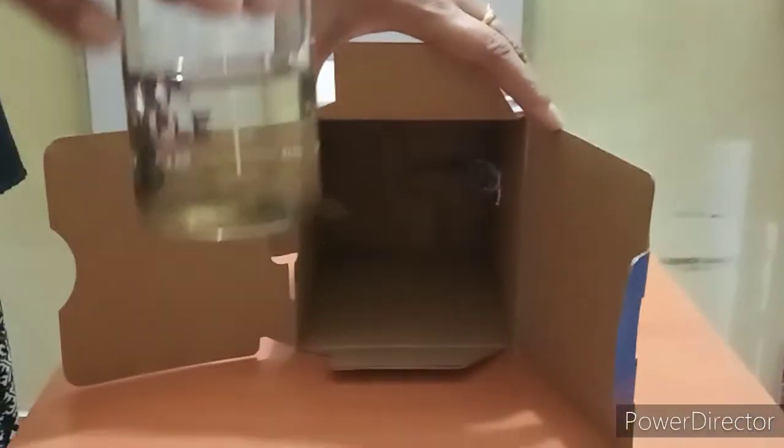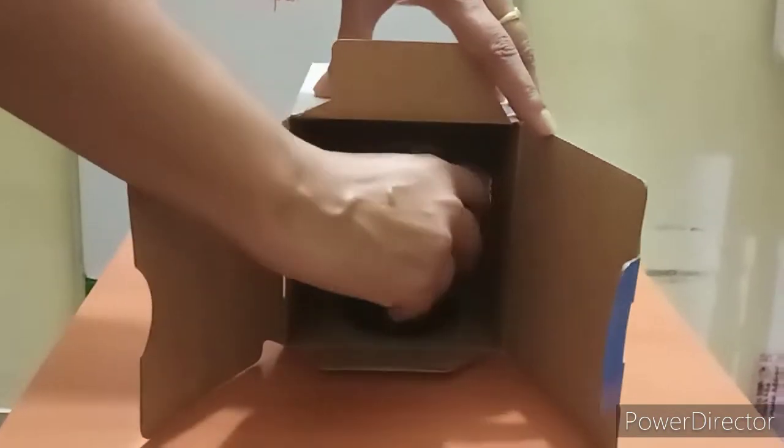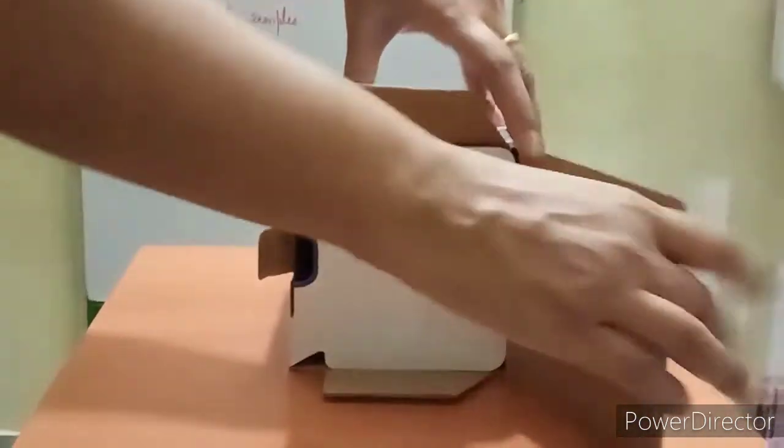Similarly, we are going to perform the experiment for sample B. Similarly, we are going to keep sample B inside the cardboard box and place it between the two holes and close the lid.